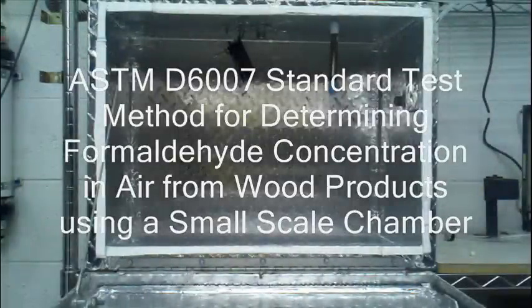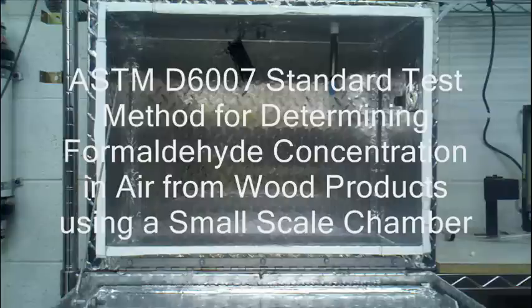This video covers the test method ASTM D6007 for determining formaldehyde concentration in air from wood products using a small-scale chamber.